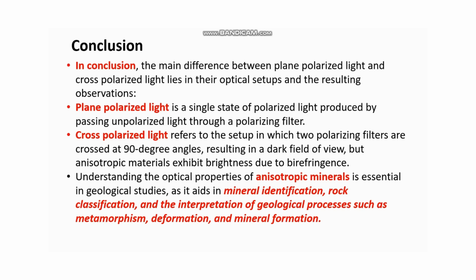But anisotropic materials show brightness due to birefringence, the ability to double refract. Understanding the optical properties of anisotropic minerals is essential in geological studies, as it aids in mineral identification, rock classification, and the interpretation of geological processes such as metamorphism, deformation, and mineral formation.